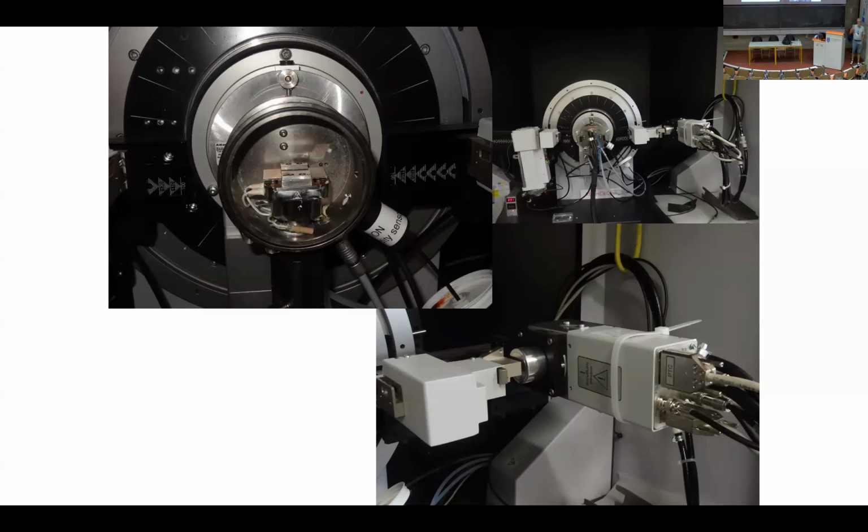What you are doing when you are measuring on your scanning electron microscope or electron microprobe is interacting with a high energy beam with your sample to generate fluorescence from all atoms that are present in your sample. In this case, you are not recording information on the periodicity within your crystals, but you are recording intensity about what types of atoms I have in my sample. I don't care where they are, but I want to know they are present.